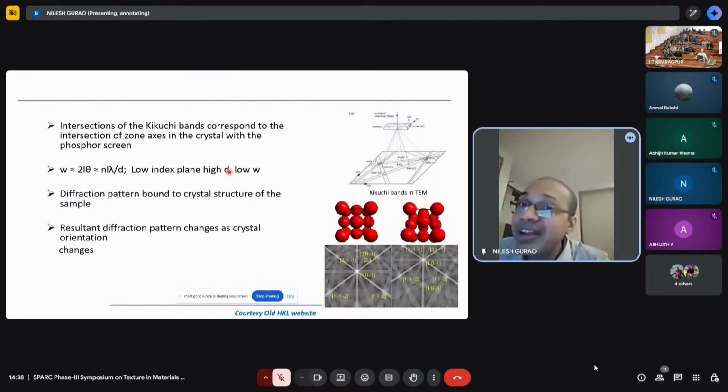But if you don't collect the data in the correct way, or if we are not aware of how to use the data, what are the problems that we are getting, right? You may be collecting data on one machine and doing analysis using another software. If we do not maintain the frame of reference, we will end up with, there is a term in computational materials engineering, people talk about garbage in and garbage out.